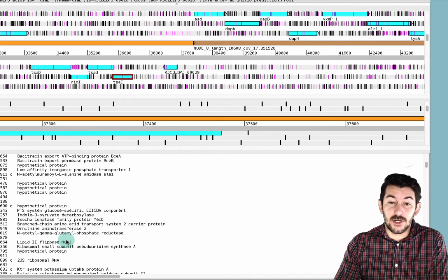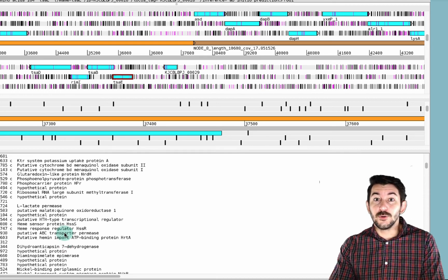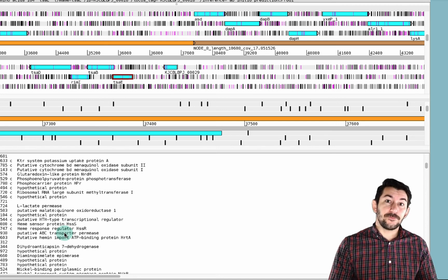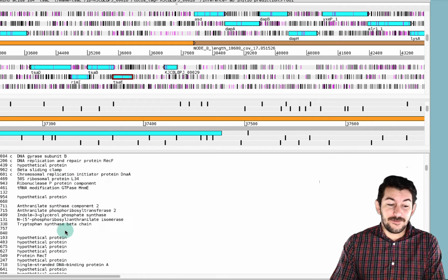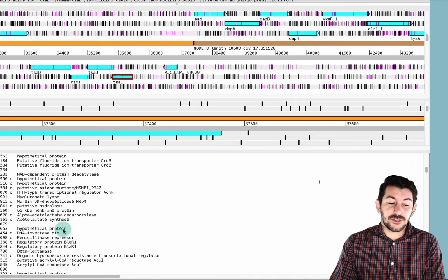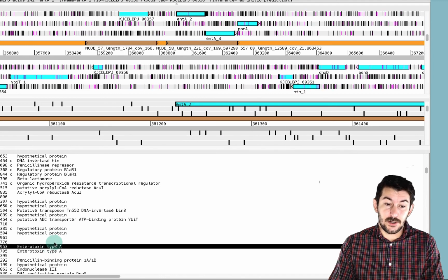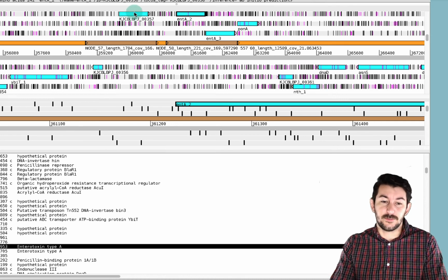So you made this. You took a bunch of 101 base pair sequences. You strung 800,000 of them together times 2. And then you went through the whole thing and found all the genes that match genes from known bacterial references and annotated them. So here's the enterotoxin gene, where it's located. It's just downstream of this KJCBL gene, something like that.